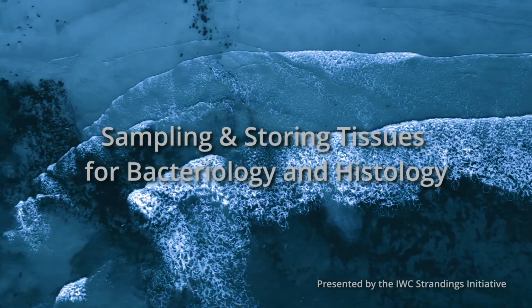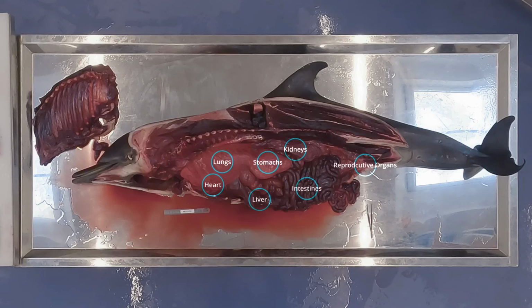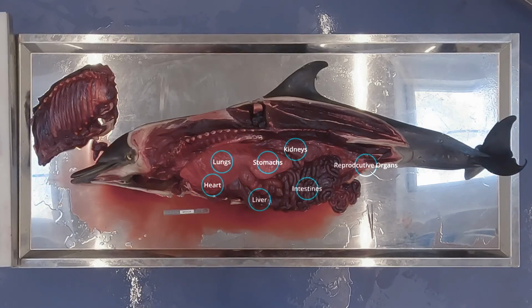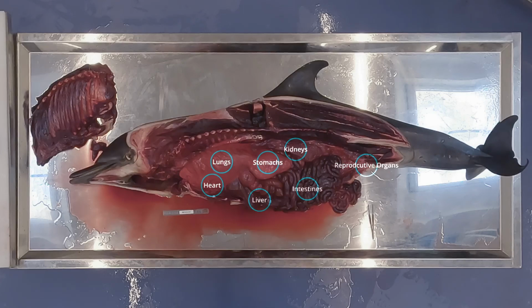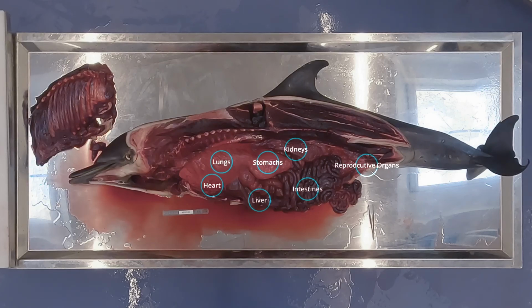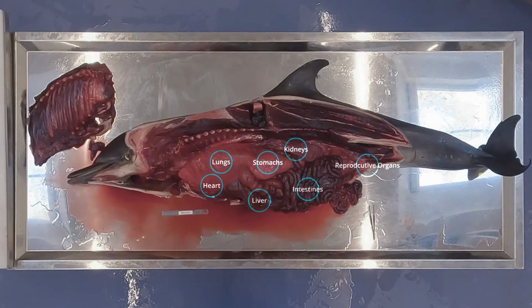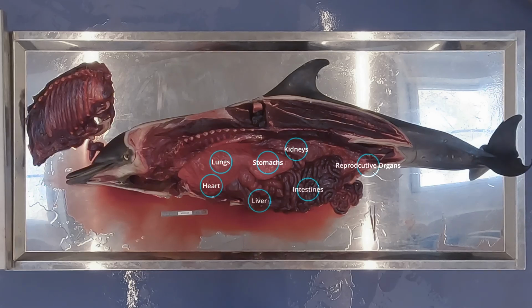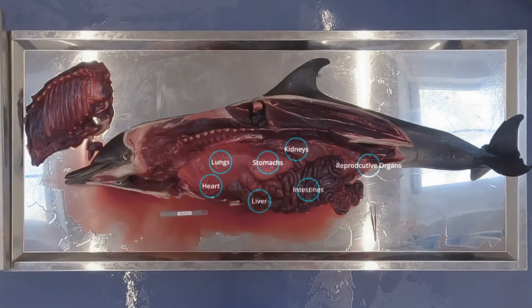Before collecting samples, coordinate with your diagnostic laboratory to establish their preferred sampling protocols. As a quick reminder, the priority tissues to be sampled for bacteriology and histopathology are the lungs, heart, liver, spleen, kidneys, reproductive organs, and, where practical, the brain. Other tissues should be taken from organs where pathology is suspected.